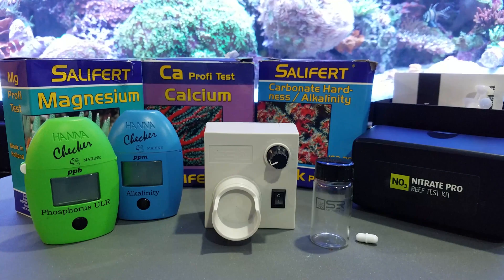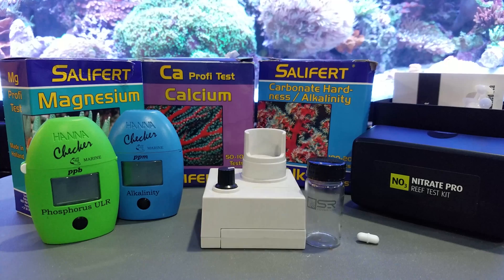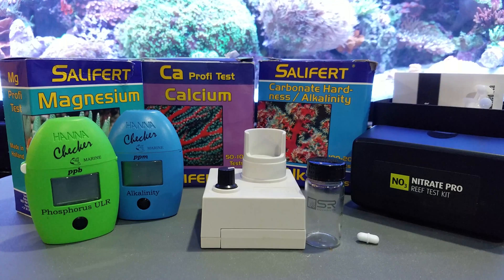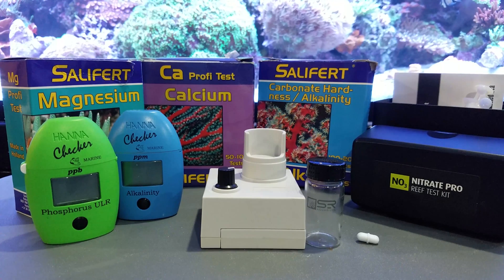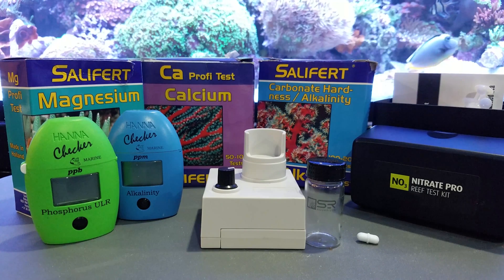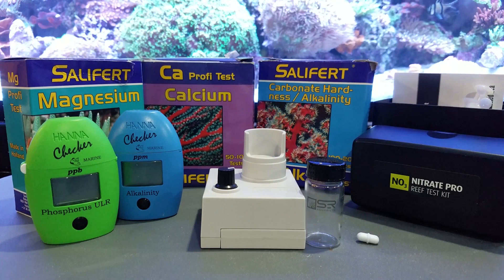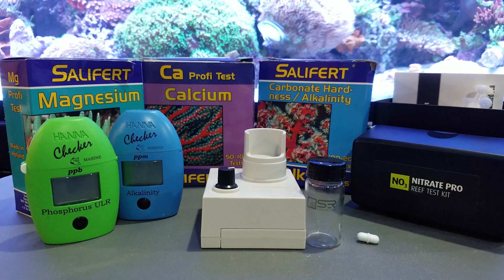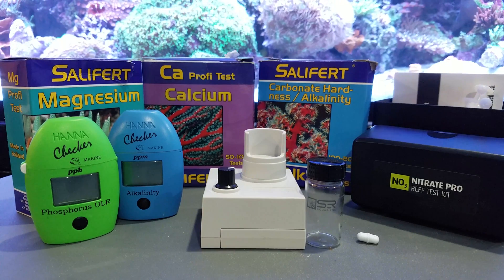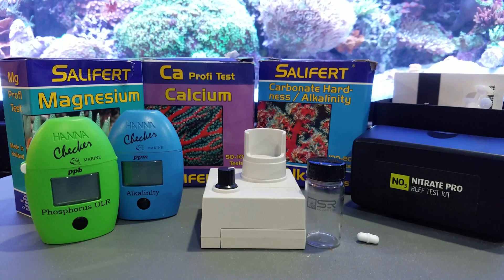In the box, we have the speed test kit itself. It has an on/off button on the top and a speed knob. Beware of the speed knob — if you turn it up too fast, you will splash everything outside of the test vial. It also comes with a vial the size of your normal Red Sea vial kits, but I've been able to use it with Salifert kits as well with no problems. You also get the magnetic stir pill — this is what causes the magic to happen. Put the pill in the test vial, start it up, set the speed, and that's it.